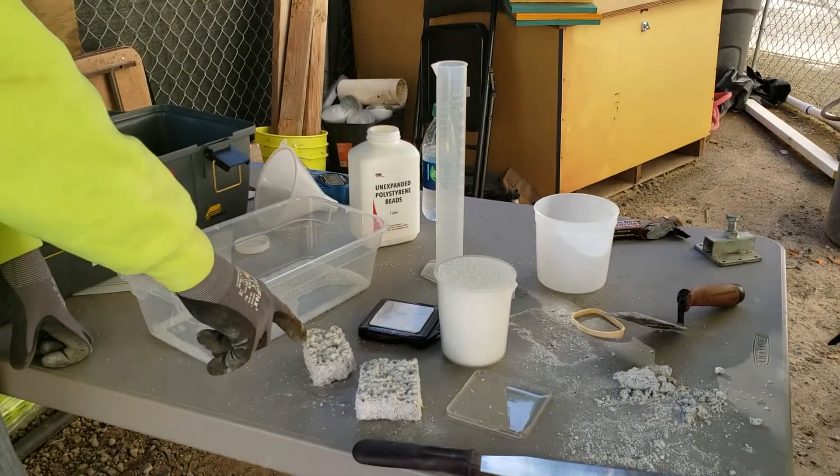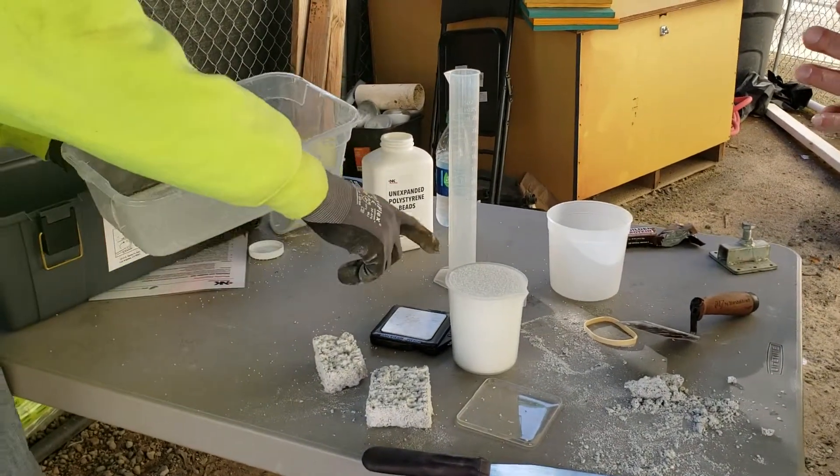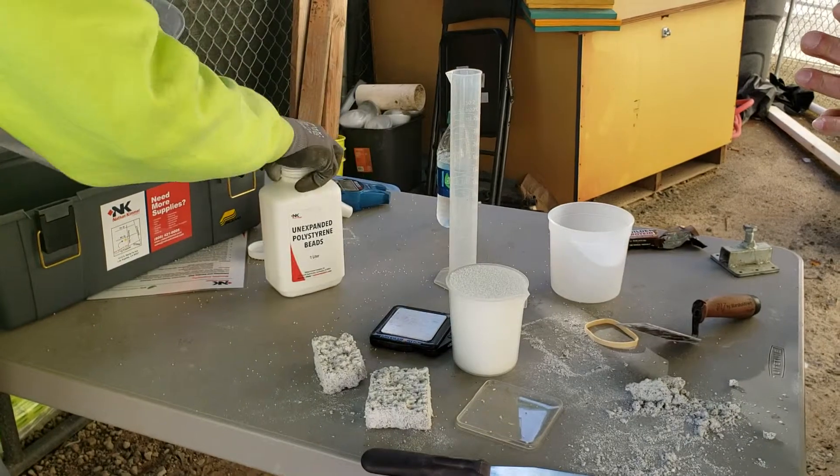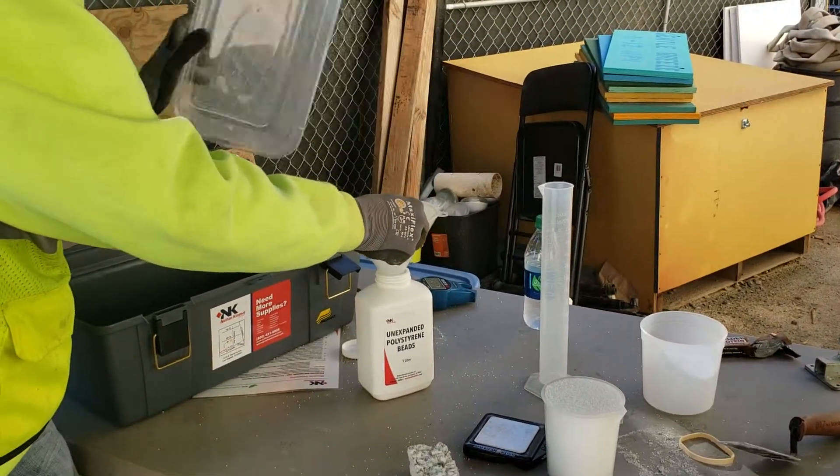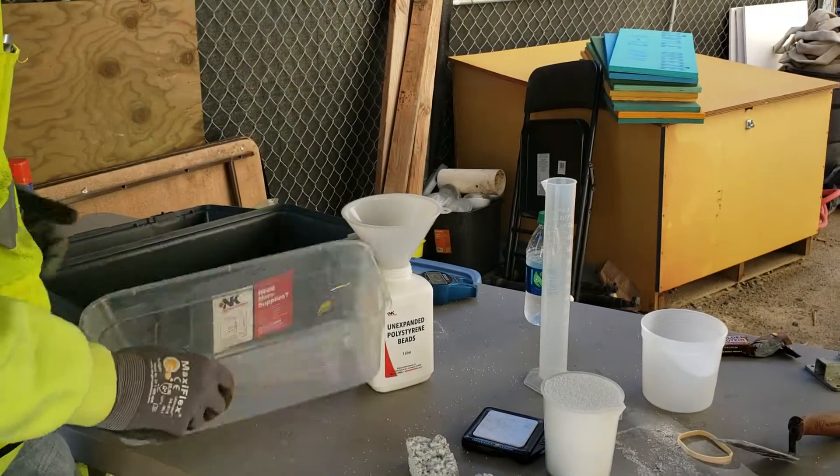Basically, the test is measuring the volume of beads that are going to be displaced by the size of the sample. We start with a perfectly full beaker. We're pouring the beads back — we don't need any of these extra beads. All we care about is what's in that beaker.